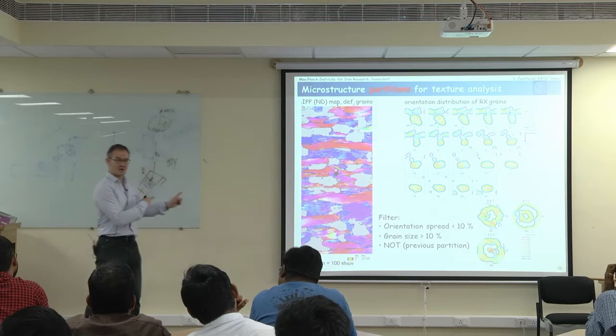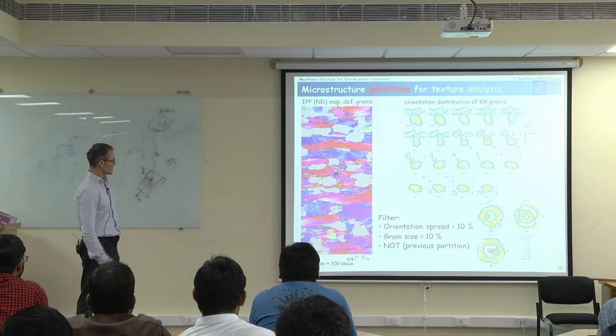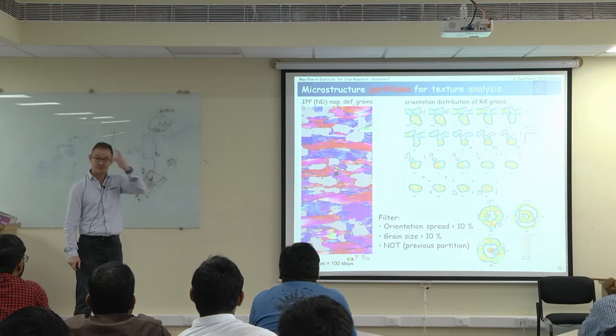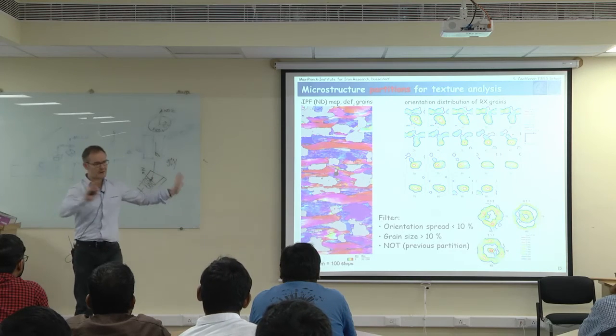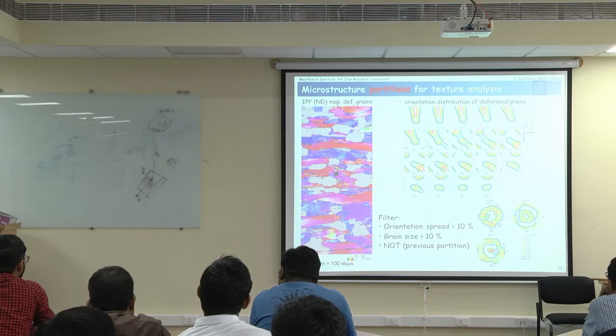It really does. If we had the live version of it, I don't know why it's not running, then we could simply say this grain also not. It's very simple. You just click on this grain and say, throw it out of the partition. Beautiful power. Okay. But anyway, if we now have this selection made, we can plot the ODF again.